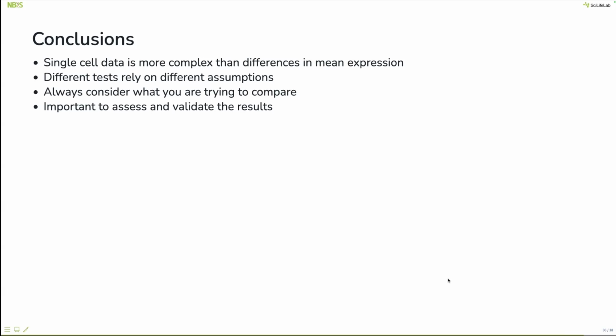But it's not a perfect solution either. And whenever you tweak your data, there's always the risk of biasing your data in the other direction by removing too much and so on. So you always need to keep in mind what you did to your data. Okay, thanks.